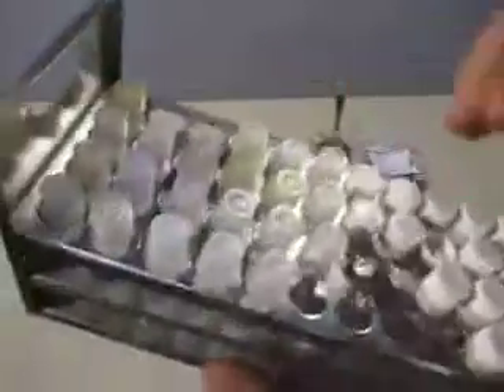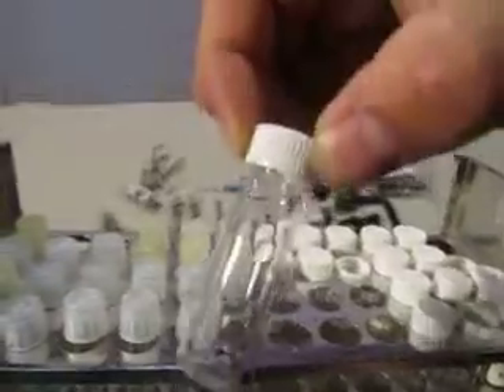Here's the vial tray. You've got the vials and the little glass jars — specimen jars or whatever they're called. It's stainless steel and needs to be cleaned.